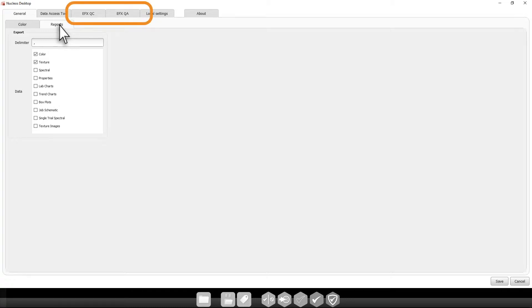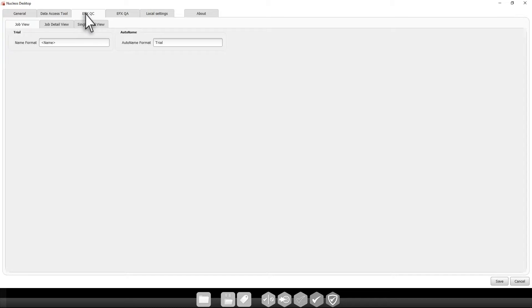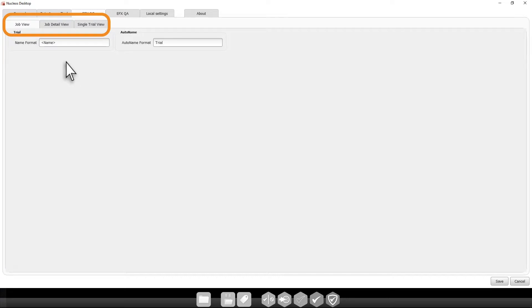The EFXQC and EFXQA tabs both allow us to adjust the same settings for each of these applications. These three tabs correspond to the same tabs you will see when working in the EFXQC app. Here you can specify your trials name format and how to auto-name your trials.